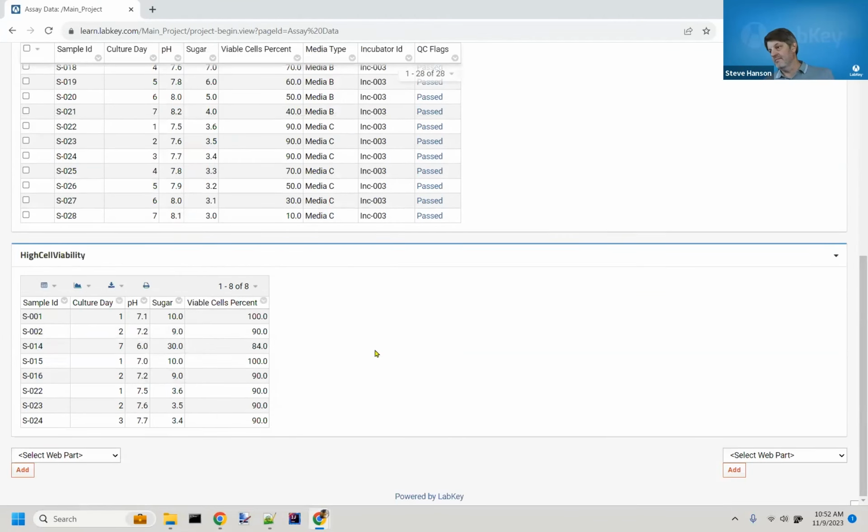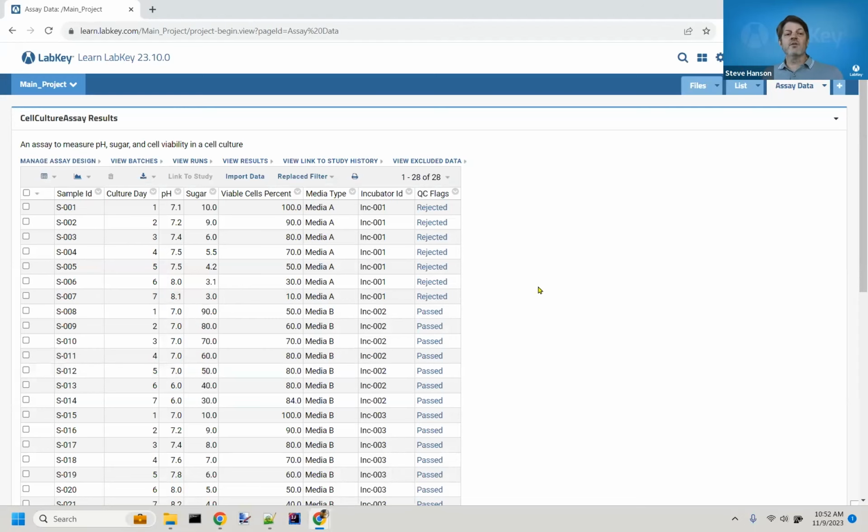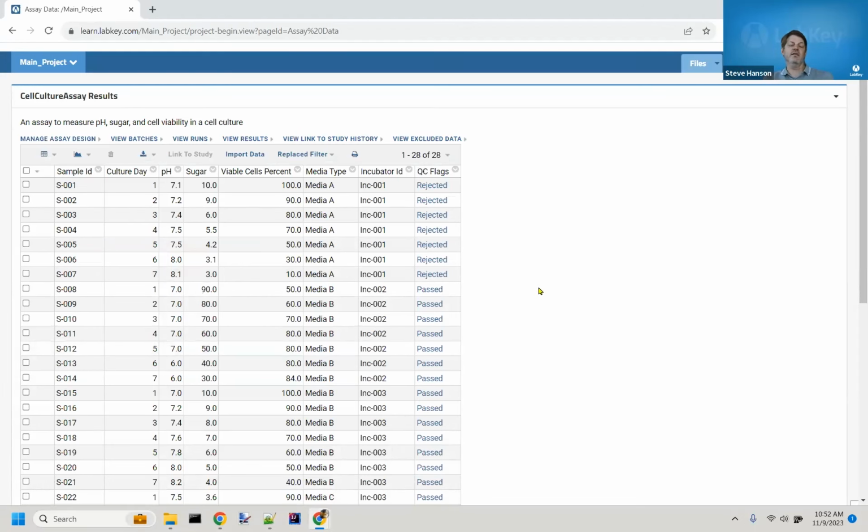Great. Now that's the most boring SQL you've ever seen. You can do a lot more with it. I think a natural piece of SQL would be to ask something like this.